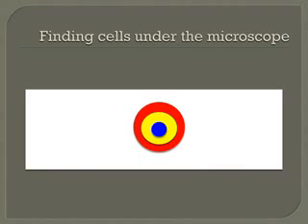If you're using the red scanning objective lens, you can see a good deal of the slide that's supposed to be represented in white. Effectively, you're not zooming in on your subject too much. If you're slightly off center, you might still see some of the cells or whatever subject you're looking at. In addition, getting objects into focus using the scanning power objective lens is comparatively easy.